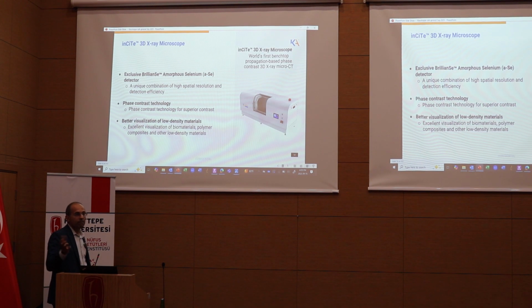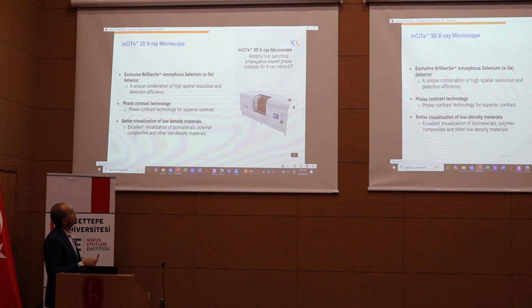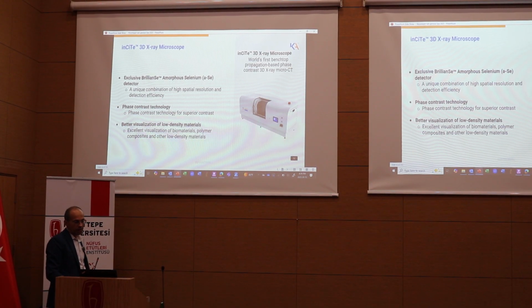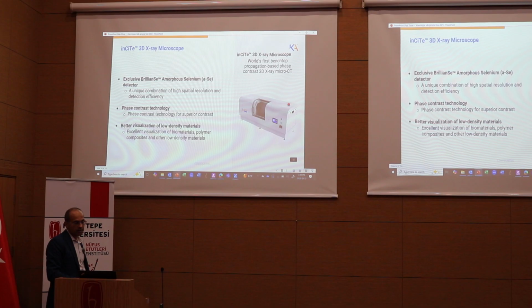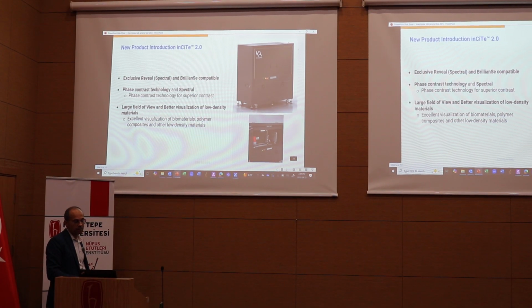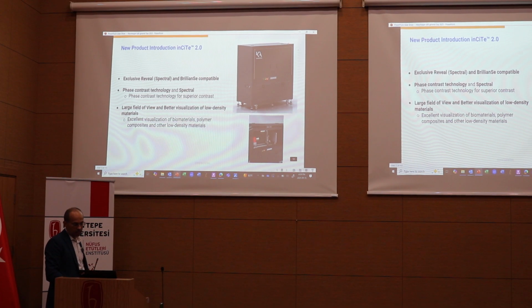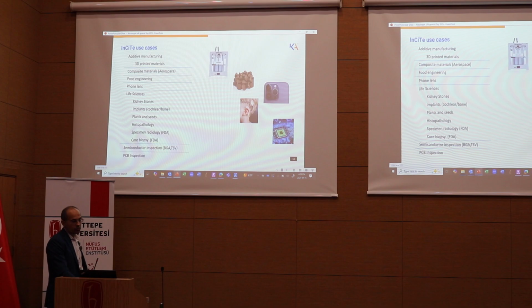So the company that commercialized this technology took that device and made a benchtop micro CT out of it so that it can be used by scientists. And so a lot of the images that you'll see were actually taken using this micro CT. And there's another micro CT that's coming out that's a little bit larger. It's got some more features in it. But like I said, the use cases are quite numerous.